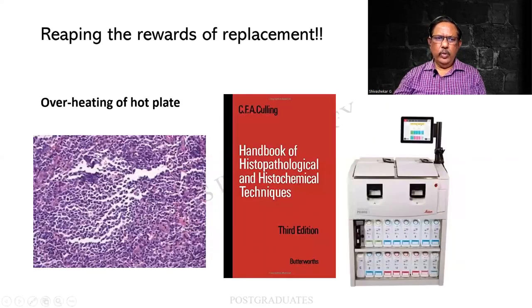And this again, overheating in a hot plate in this case. This is a specimen, I think it's a lymph node or so. There is no business for such spaces to be in a lymph node. It is an artifact.